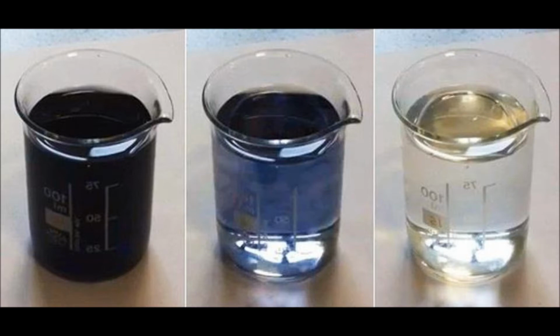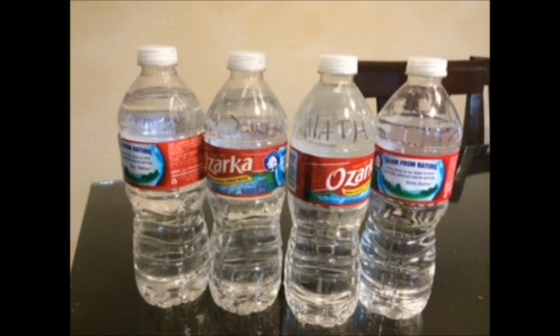Once the titration was complete, the contents were poured out and the beaker was cleaned very thoroughly. This was repeated 4 more times using a sample of 50 ml of water each time. Once the 5 trials were complete for the Science Building, we repeated the whole process with the beakers of water from the Fine Arts Building, the Math Hall, and the Language Hall.